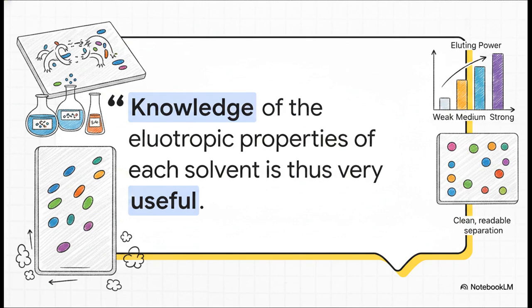If you're trying to pull apart a complex mixture where molecules are battling for surface area, picking a solvent with the exact right competitive strength is literally your only shot at getting a clean, readable separation.